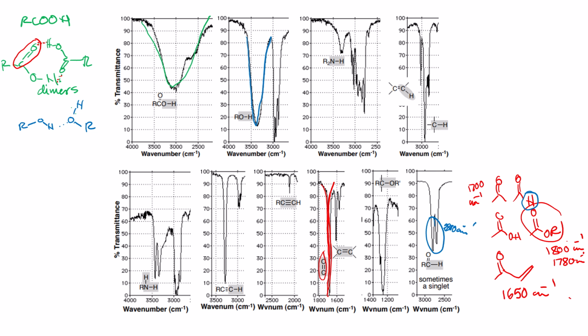However, if you have an alcohol in a diluted solution in an organic solvent, where you're not going to have hydrogen bonding, you may be able to see this. And sometimes we can see the broad one and the more sharp one. When you see this broad band, it's because you have hydrogen bonding. If you see this narrow one, then it could be a diluted alcohol solution. Okay, so these are distinct shapes that we need to remember.